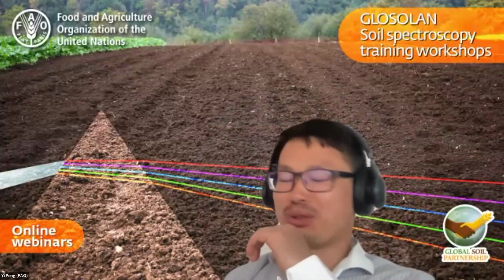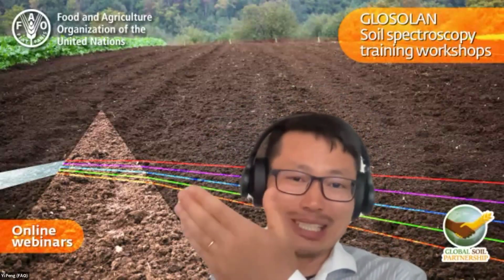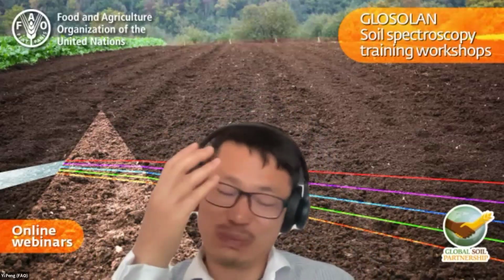Yeah. And another interesting question is about using spectroscopy for detecting nutrients, because especially this field application is directly linked to crop management, the yield, everything. I think this is what farmers are really concerned about. Another audience member asked more or less the same question: so far a lot of research work has been done for organic matter and texture, but not much for nutrients, and how far away are we from bringing this application to detecting nutrients and relating it to crop management and fertilizer recommendation applications, etc. So please.